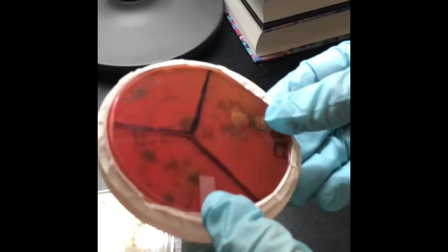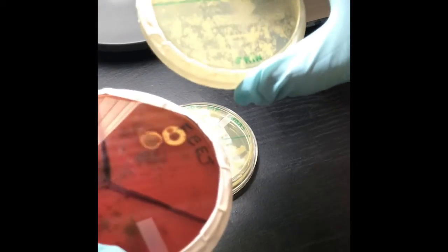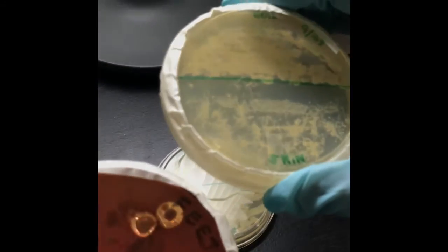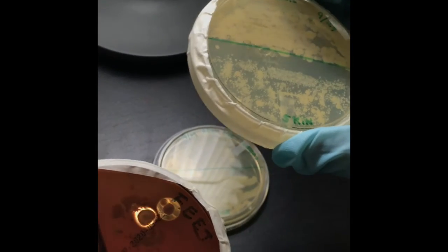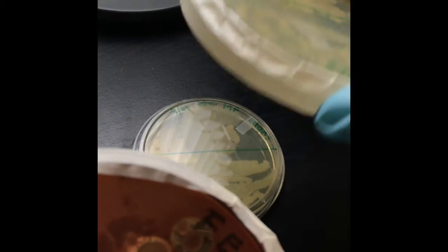Now one more point. Have you seen the blood agar plate, and this one where the human sample is? I just sealed it. I didn't have parafilm, so I sealed it with the sellotape I have. I sealed this because this is a human sample. We have to do that always. Seal the plate all around.